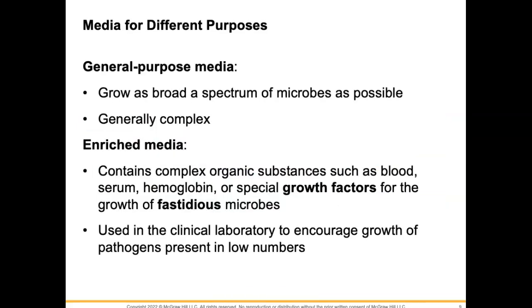So we have general purpose media. General purpose is exactly how the name explains it. It's going to grow a broad spectrum of microbes. It's not going to be picky about what it grows. It's going to grow everything.